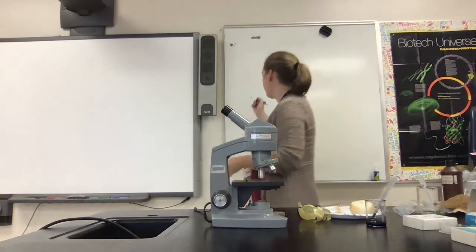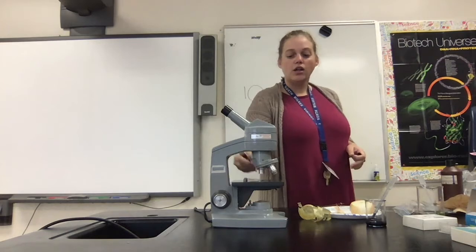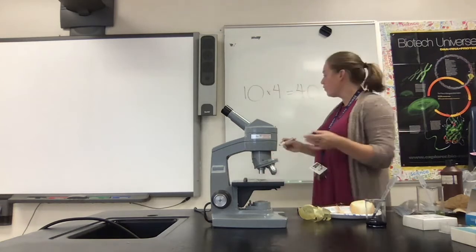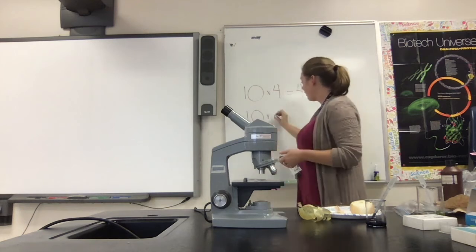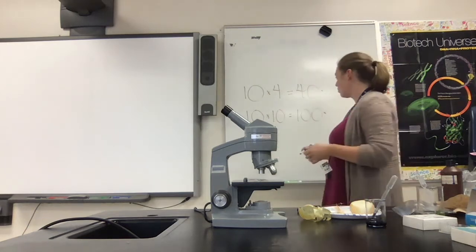However, we need to keep in mind that we also have a lens here in the eyepiece. So if we're trying to calculate the total power of magnification, then we need to take the power of the eyepiece, which in our case is 10, and multiply this by the power of the objective. If we are looking at the smallest objective, which is worth 4, then we would have a total magnification of 40. If we have an eyepiece that has a power of 10 and our objective has a power of 10 also, then we would have a total magnification of 100. So something would be 100 times larger than it normally is.